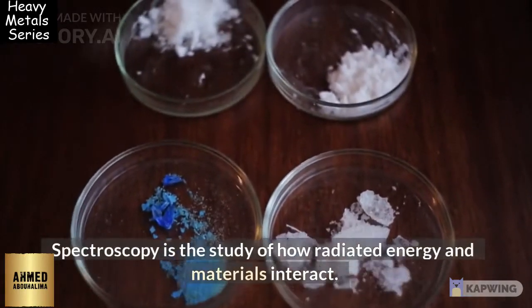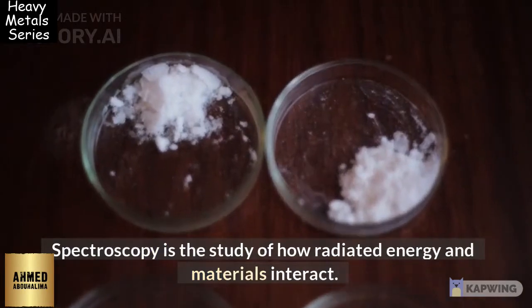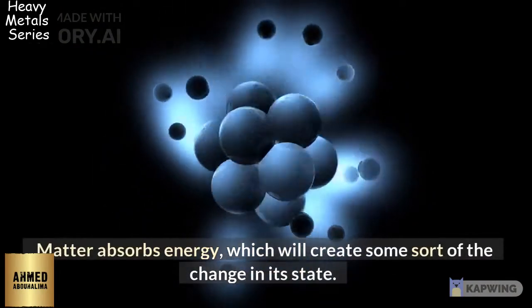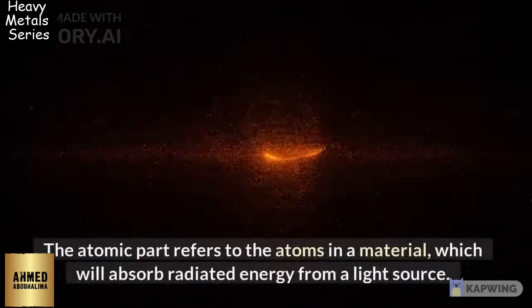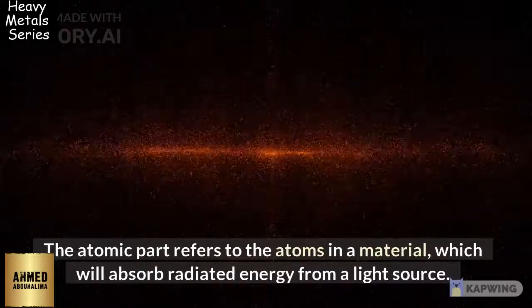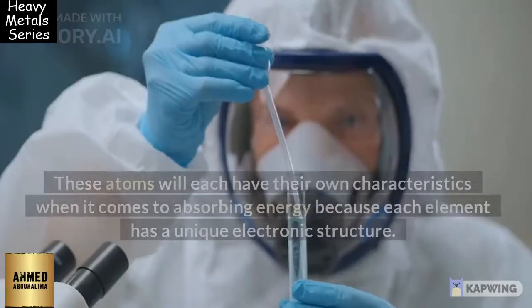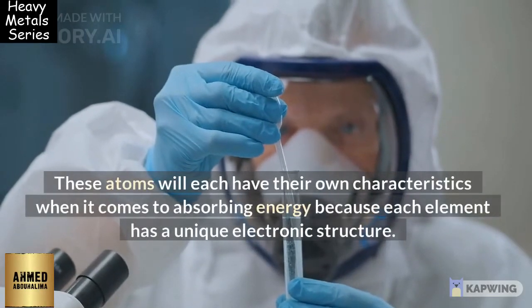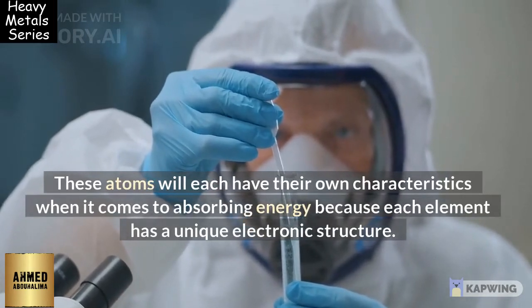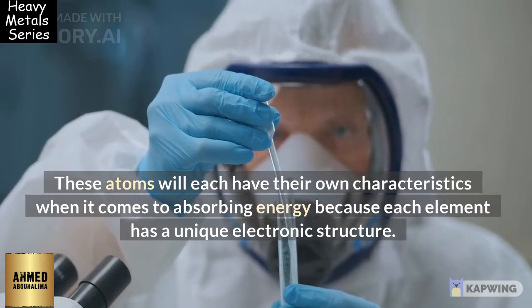Spectroscopy is the study of how radiated energy and materials interact. Matter absorbs energy, which will create some sort of change in its state. The atomic part refers to the atoms in a material, which will absorb radiated energy from a light source. These atoms will each have their own characteristics when it comes to absorbing energy, because each element has a unique electronic structure.